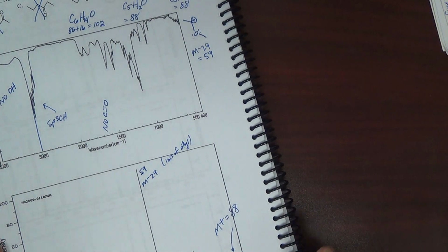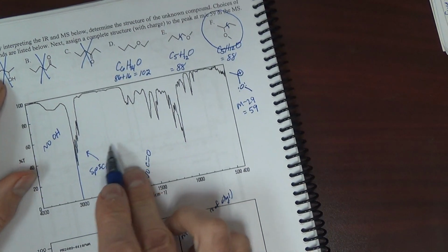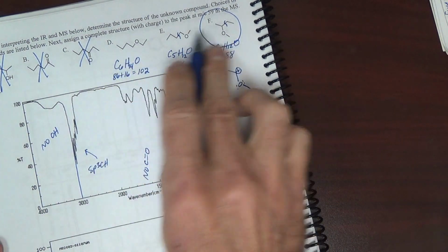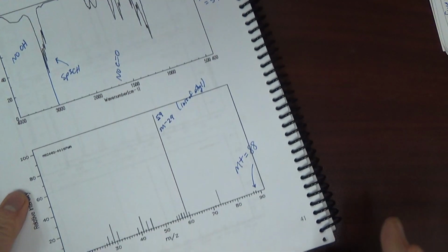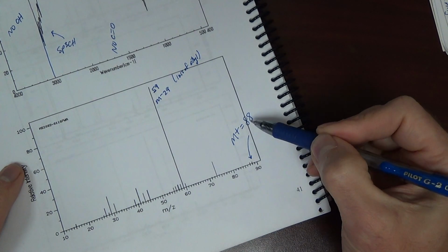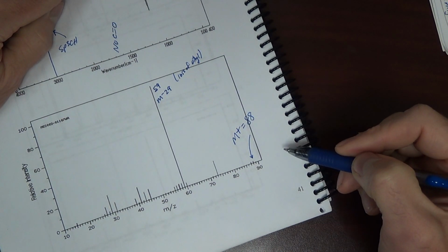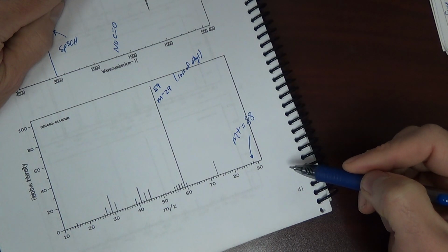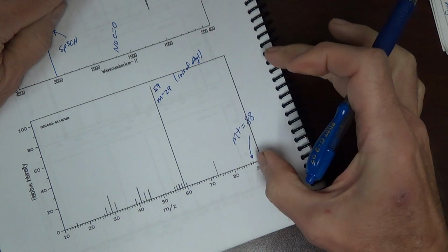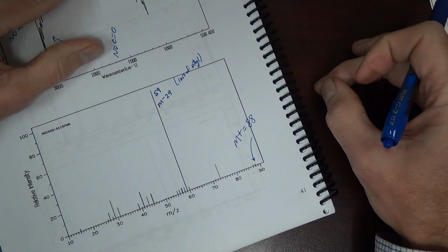What is my evidence? Well, there's no carbonyl, so we've excluded these. There's no OH, so we excluded that one. The IR could match any one of these last three ethers. But the mass spec seems to show a molecular weight of 88, or support that. It does not seem to show a mass of 102. Again, that was cut off, but that sort of tells us that maybe it wasn't there. In terms of just approaching this textbook example here. In real life, you may have the entire spectrum to look at.